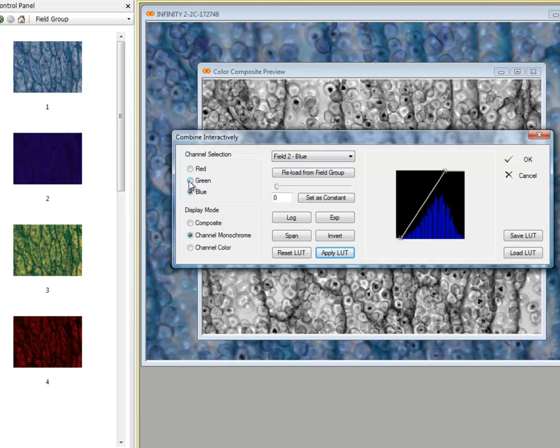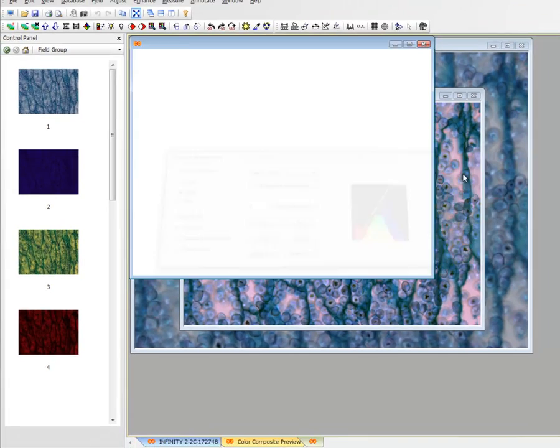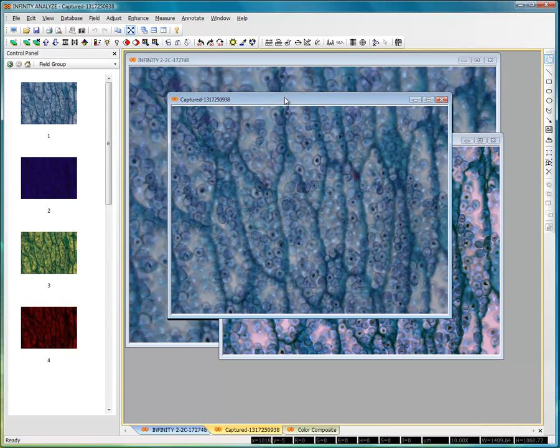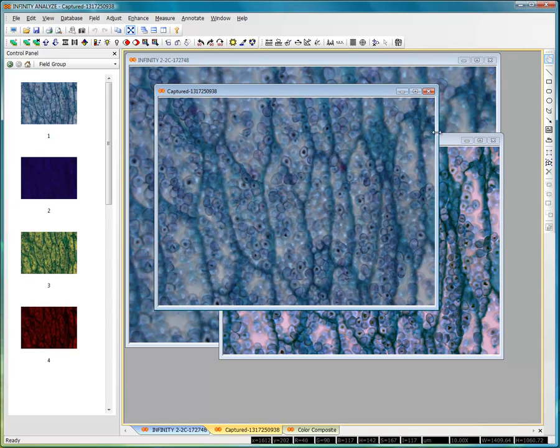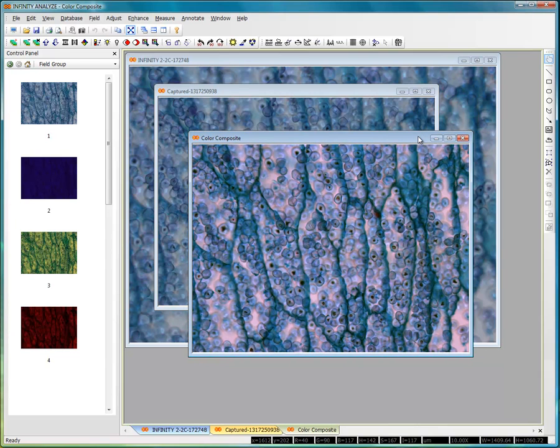The green channel I'm going to leave where it is. Looking at my color composite now, I'm fairly happy with those results — I've manipulated the red and the blue channels and overlaid them with the green. I'm now going to click the OK button, and my resulting color composite is displayed in a new window. Whether or not this particular color composition is relevant to what you want to do depends on the stains you're using, the illumination, the filters that you're using, and the overall objective for performing a color composition. That's a very quick overview of color composition using images from a color camera.